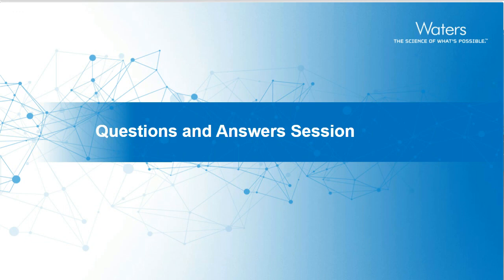Another question that's come through on the RADIAN-ASAP for Emily. In the presentation, you talked about using LiveID in live mode. Can you also use it in post-processing? And are there any advantages or disadvantages of either approach? You can use both. It's really just a matter of personal preference. I usually use post-processing because I normally run all my samples and then go back and look at all the results as one big lump rather than doing it one by one, but it really just depends on what you prefer.